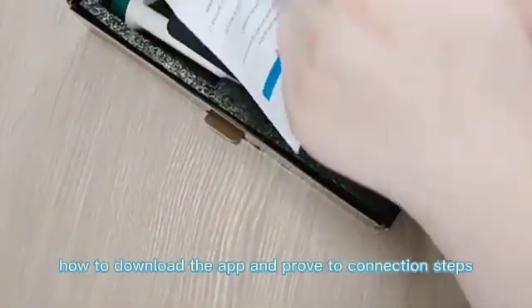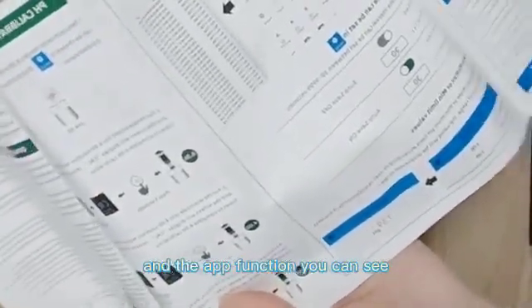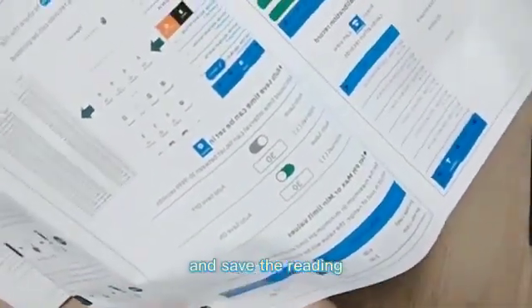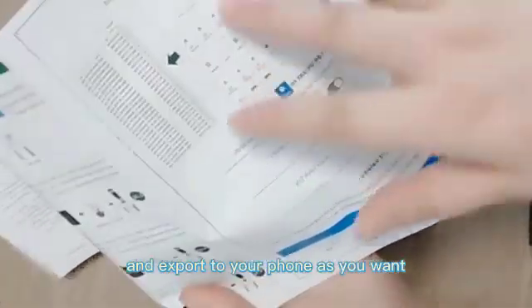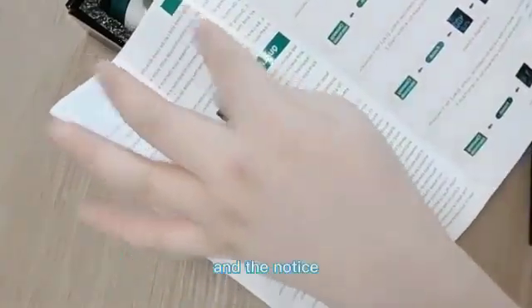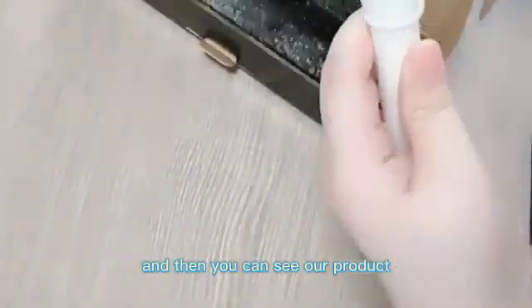You can see how to download the app and the Bluetooth connection steps. The app functions let you view measurements on your phone, save readings, and export data. There are also calibration steps, notices, and quality assurance information — it's very complete.